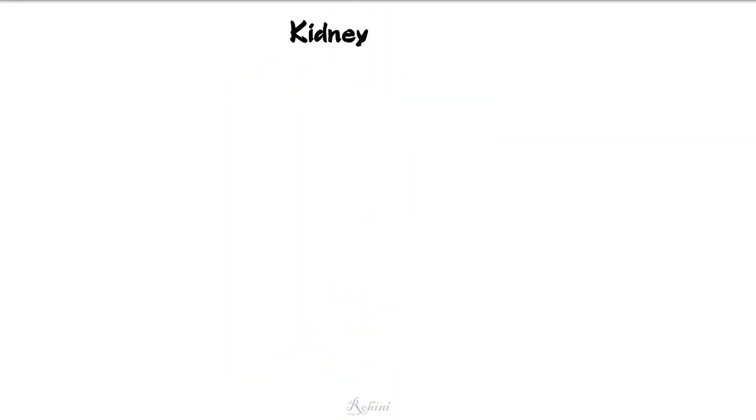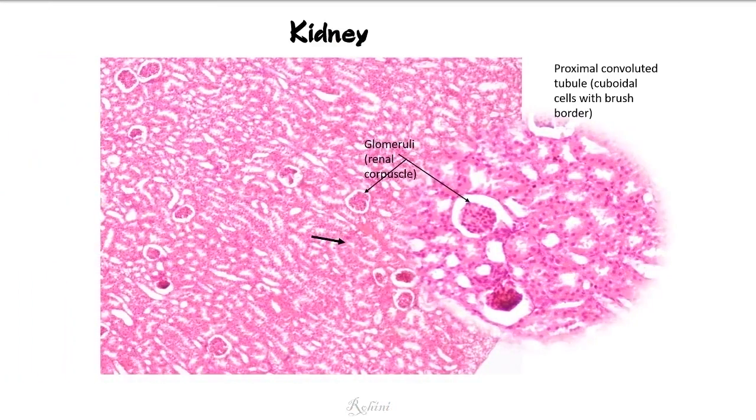In the focused area of kidney, the cortex can be identified by the presence of the Bowman's capsule with the glomeruli, which appear like a round mass. Surrounding this we find cut sections of the proximal and distal convoluted tubules.